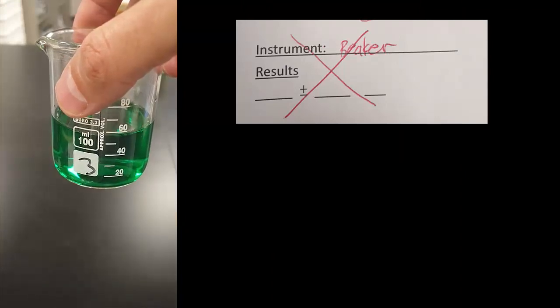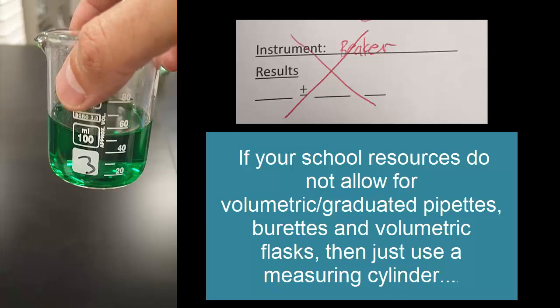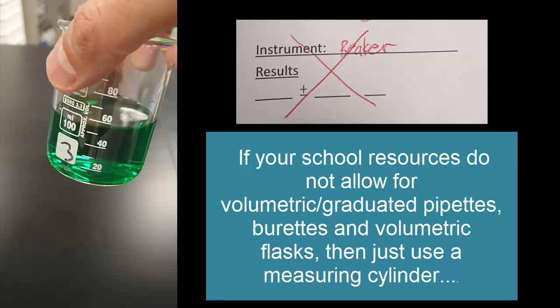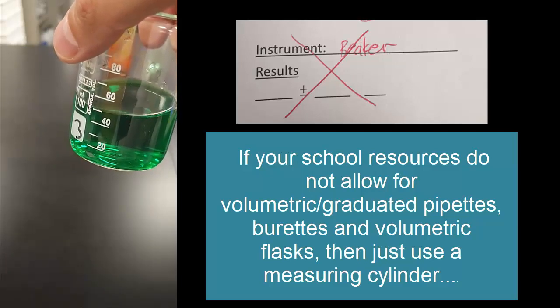Now the beaker here, never measure in a beaker. So what do you measure in? I'll just pause it on that one. If you're using senior chemistry, it's a graduated pipette, a volumetric pipette, volumetric flask, or burette.